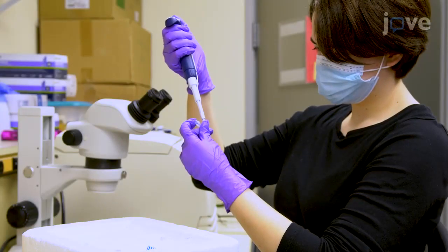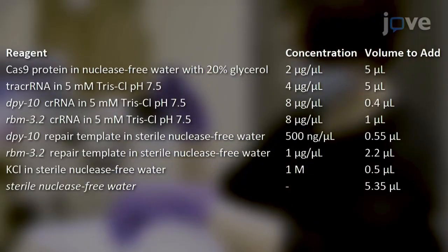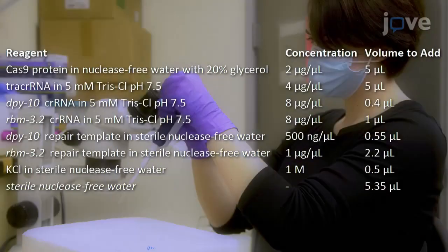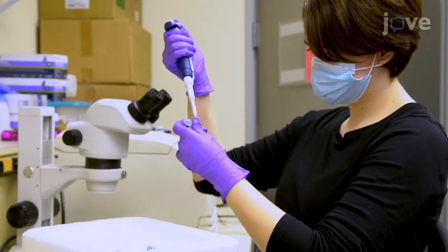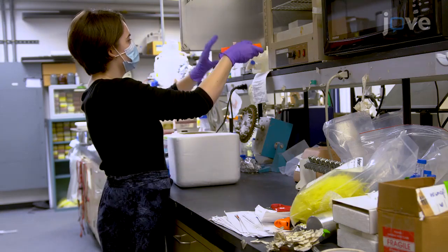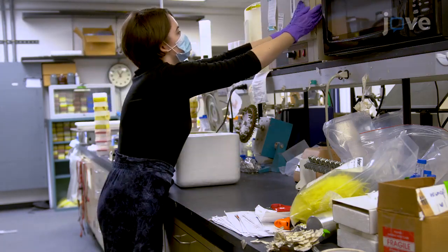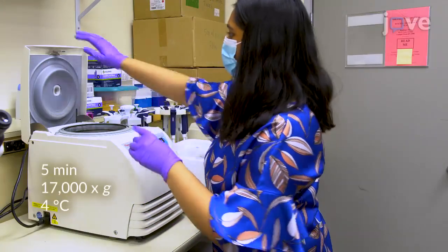The next morning, prepare the injection mix as outlined in the table in sterile nuclease-free tubes and mix by pipetting. Incubate the injection mix at 37 degrees Celsius for 15 minutes to assemble the ribonucleoprotein complexes, then spin down the mix by centrifugation.